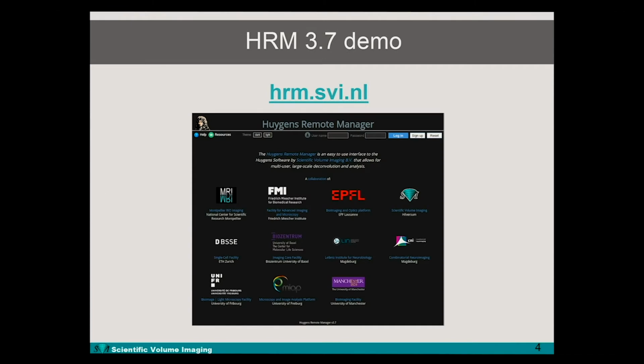Today I would like to tell you more about the latest release of the Huygens Remote Manager, HRM 3.7. In order to do so, I'm going to use this demo installation which we have made available at hrm.svi.nl. I would like to encourage you to feel free to use it for testing purposes.